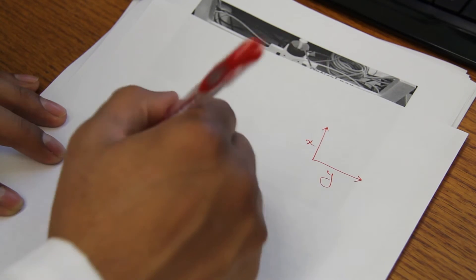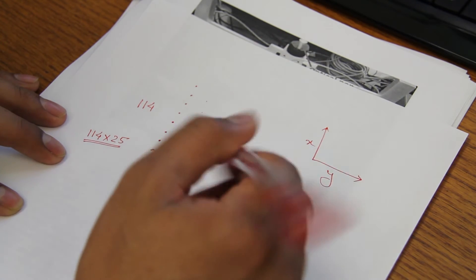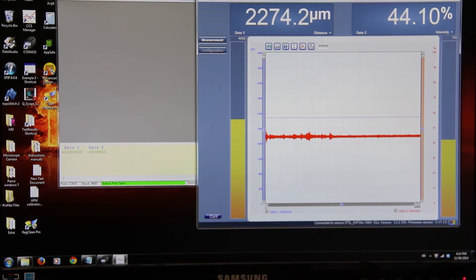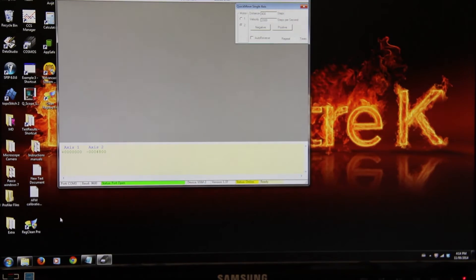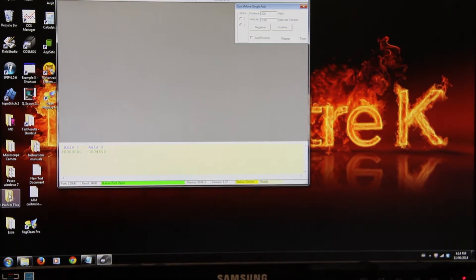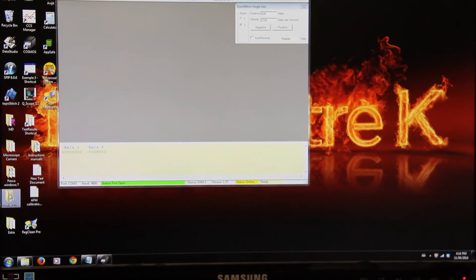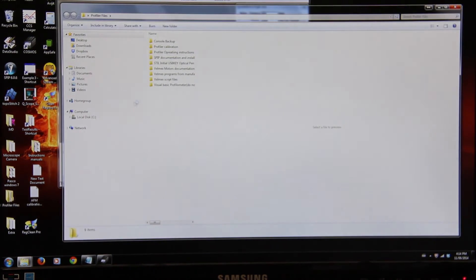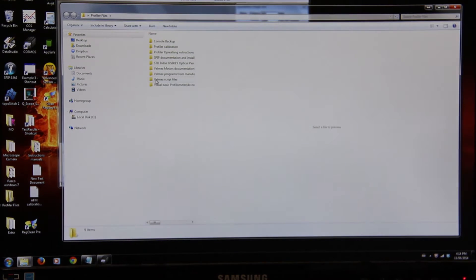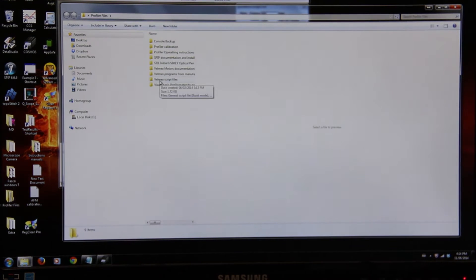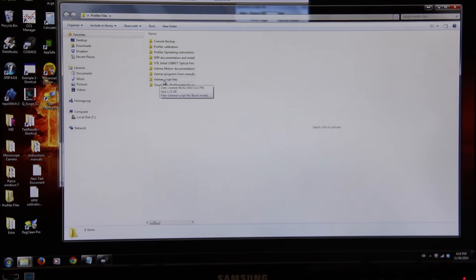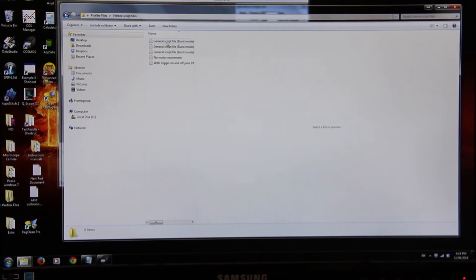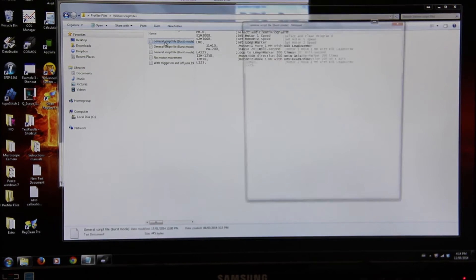Close CCS manager from the next step. Go to Profiler Files, Velmex script files. Open general script file.